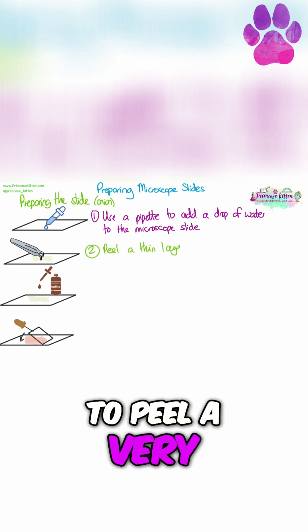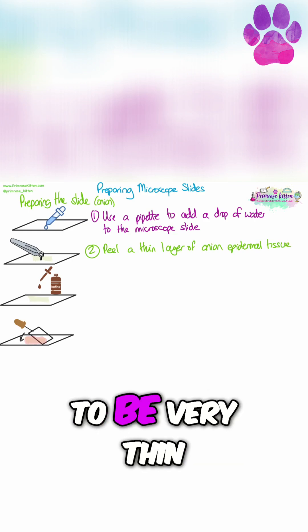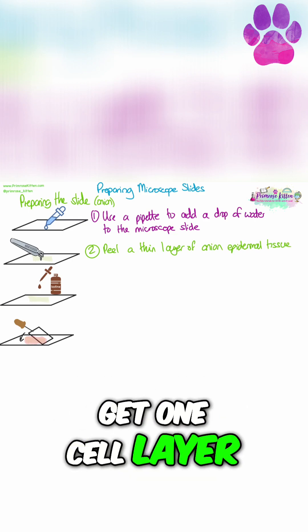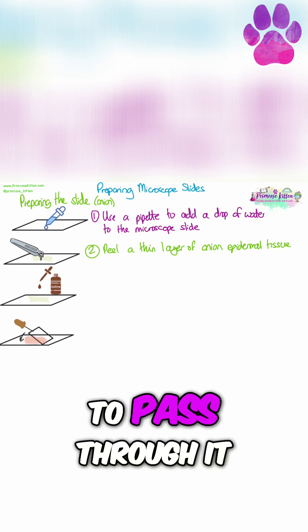Then you're going to need to peel a very thin layer of onion epidermal tissue. We need the layer to be very thin because we're trying to get one cell layer, so we don't have multiple layers of cells, and we need the light to be able to pass through it.